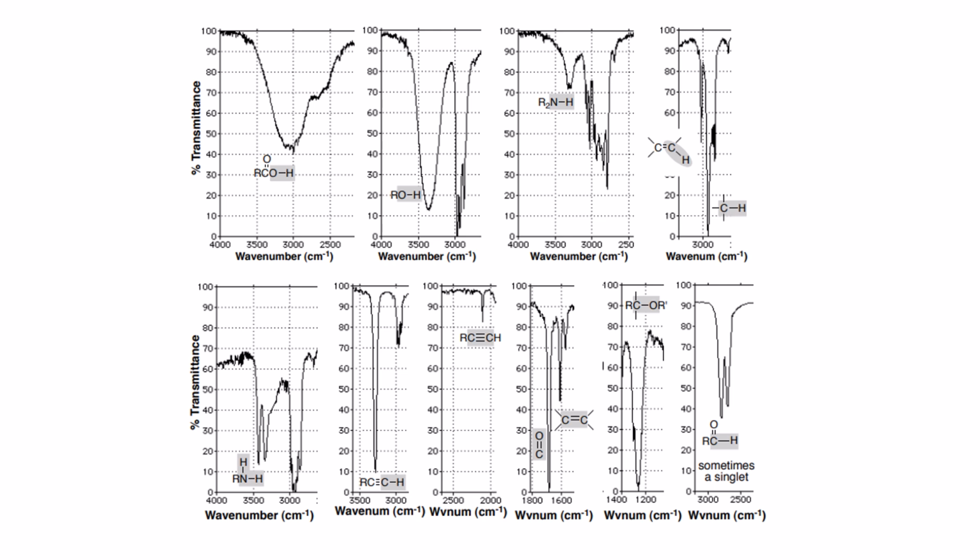Talking about shape and intensity, here we have some examples of functional groups. The first functional group that is here is carboxylic acid. And two things are characteristic of carboxylic acid. When you go and analyze, I'm going to redraw the structure in a different way.